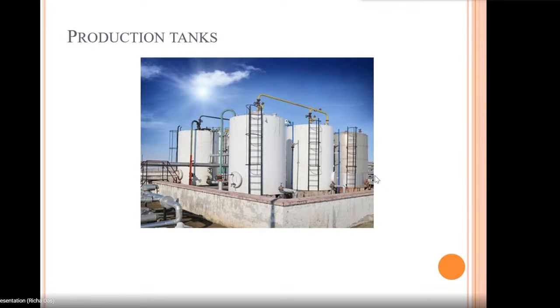And then these are the main fermenters I was talking about when discussing the ideal fermenter. These are the production tanks, or main fermenters, where the actual commercial process of fermentation takes place, and they are very large. They might be 20 to 30 feet tall, or even more.